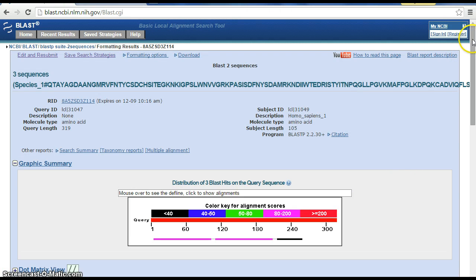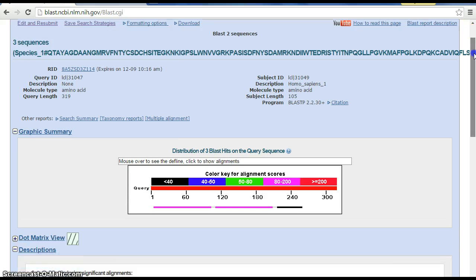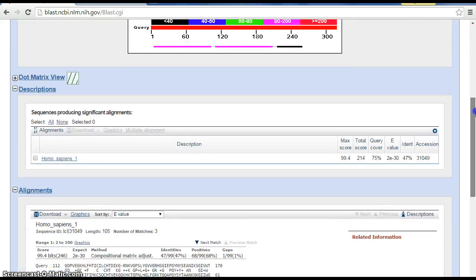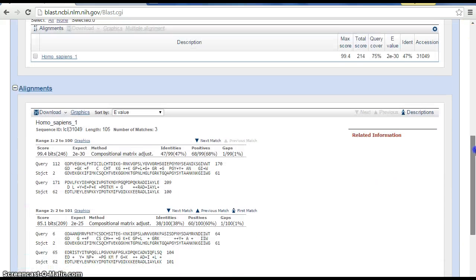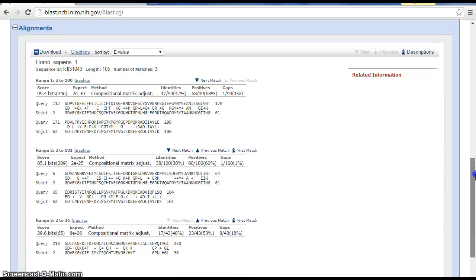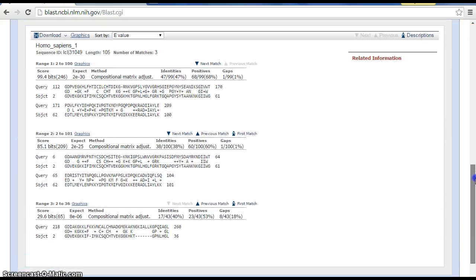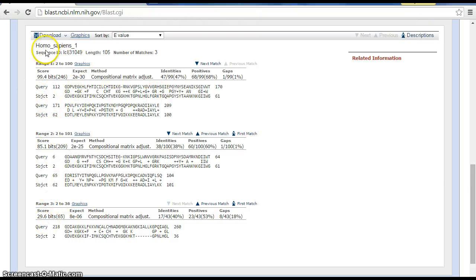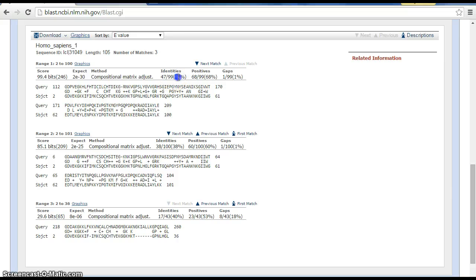Here are our results. Let's scroll down and you'll notice three different sets of data here. Homo sapiens is what we're comparing to. For the first species, our match was 47%, that's our identity value.